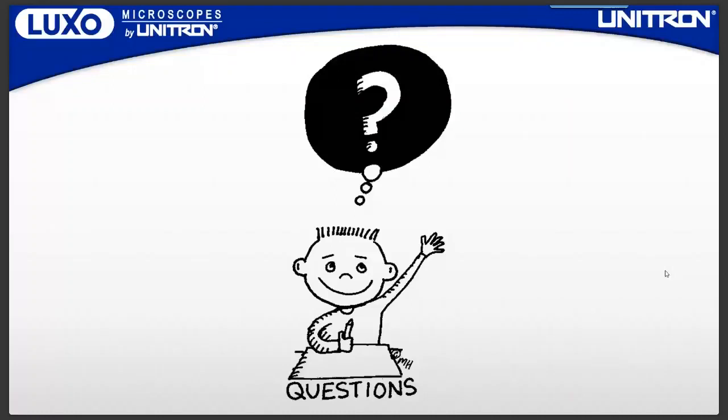Okay. Yeah, I think some people might refer to the template as a jig, just a way to ensure alignment and orientation. I didn't want to say jig because I thought that was more of an Irish term. Right. Oh, right. Okay, so some other questions.